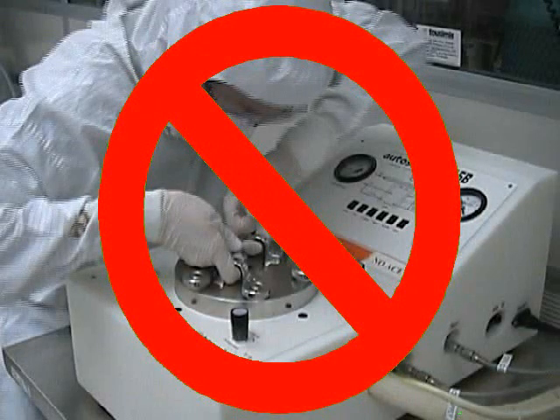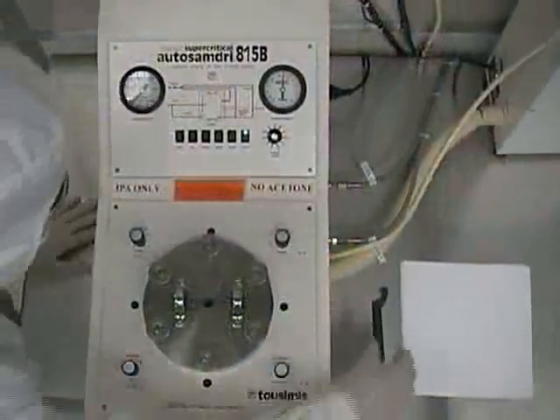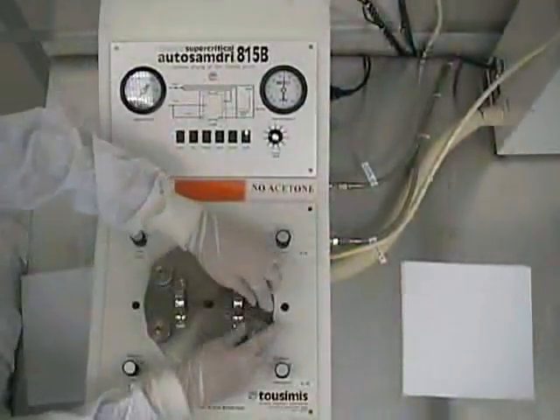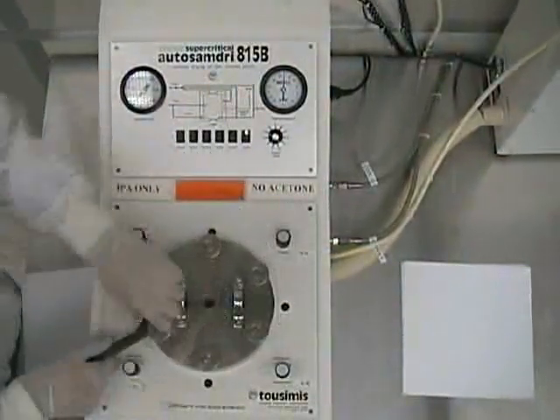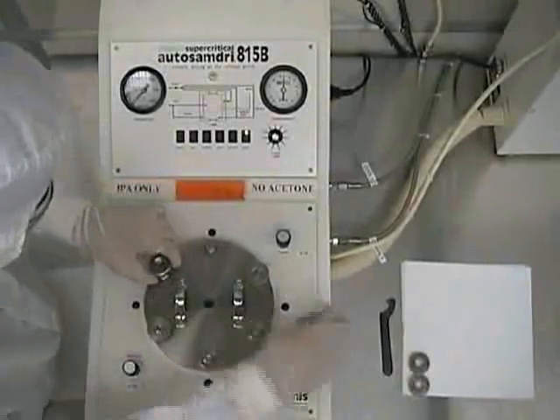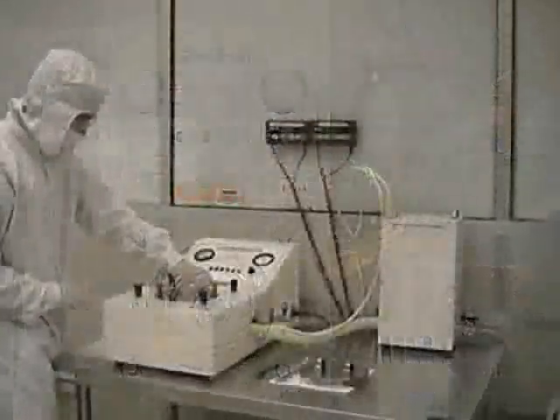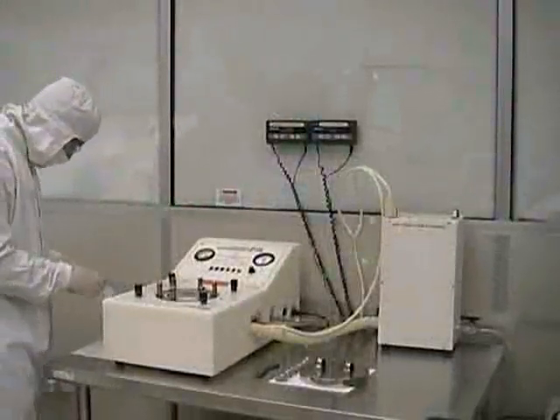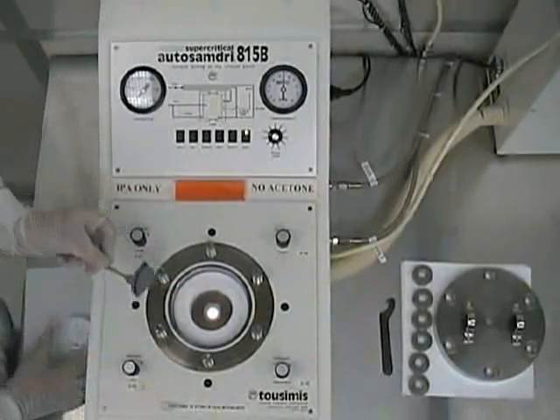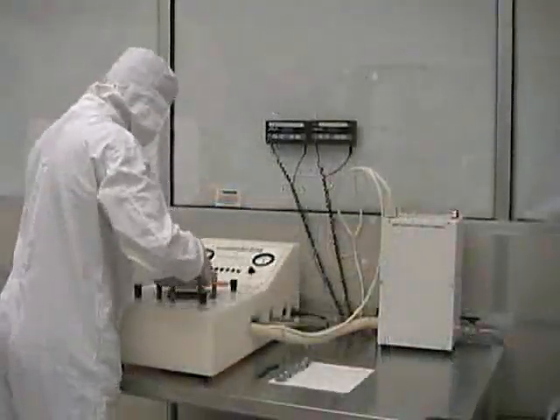Do not attempt to remove the chamber lid while the unit is still pressurized — it won't come off and the unit could be damaged. Once the unit has reached atmospheric pressure, the chamber lid may be removed by evenly loosening all the knurled nuts using the spanning wrench in a reverse star pattern. Wafers or chips should then be removed from the chamber for further processing. Once you've removed your sample, seal the chamber with the lid to help keep it clean and moisture free.